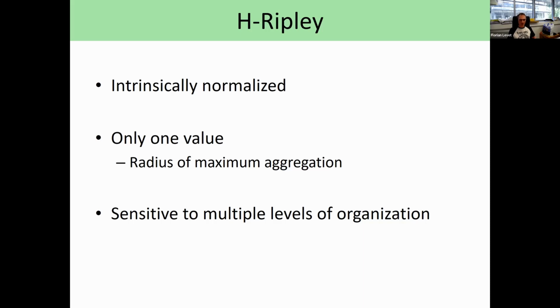So we cannot say that there is really user bias here. You just take a big frame and try to see if there is some radius of maximal aggregation. Usually people will use that in some ROI where there are only two levels of organization, or because it takes some time to compute, they will use an ROI. And in a way, your bias comes from your choice of ROI, obviously. ROI, region of interest.